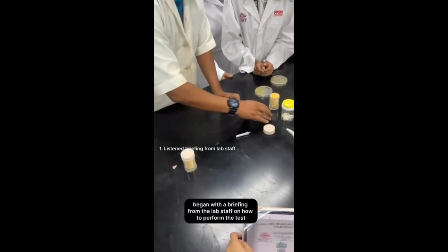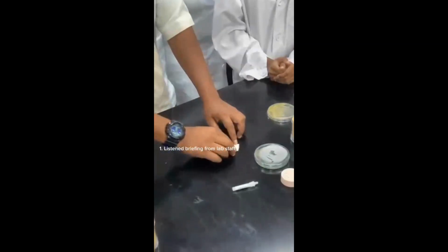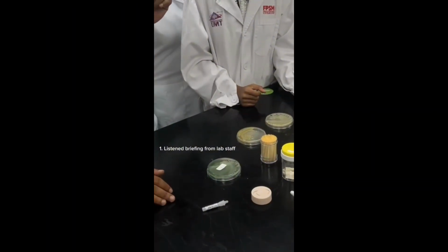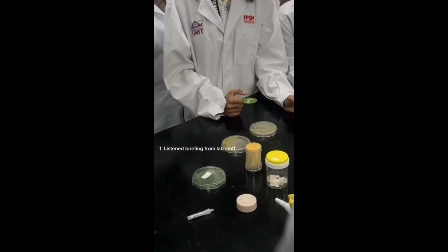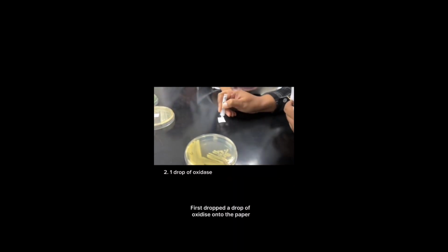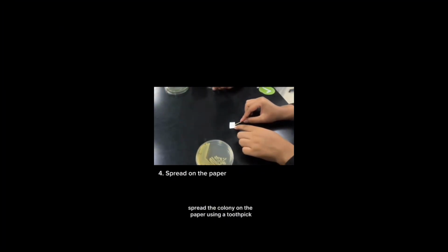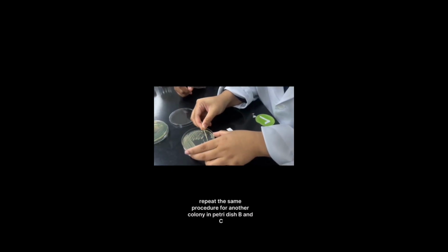The oxidase test begins with a briefing from the lab staff on how to perform the test. First, drop a drop of oxidase onto the paper. Then, take a single colony from petri dish A using a toothpick. Spread the colony on the paper using a toothpick. Repeat the same procedure for another colony in petri dish B and C.